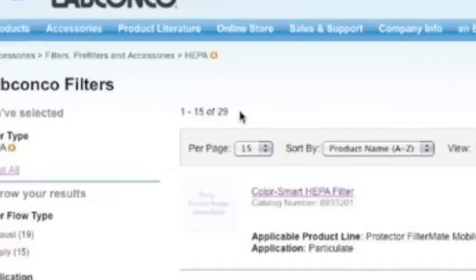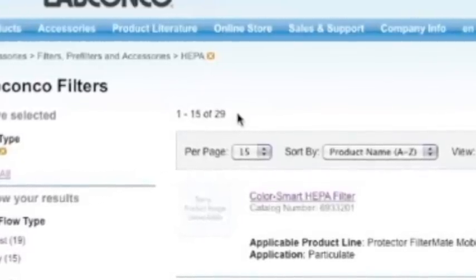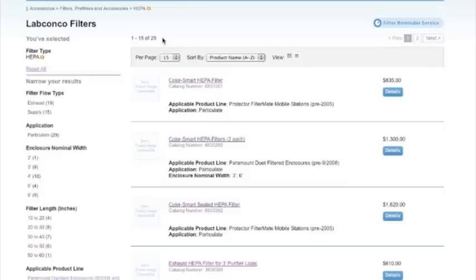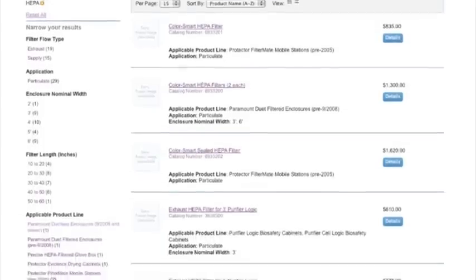This immediately narrows the results down to the 29 available HEPA filters, eliminating all others from the results found on the right.